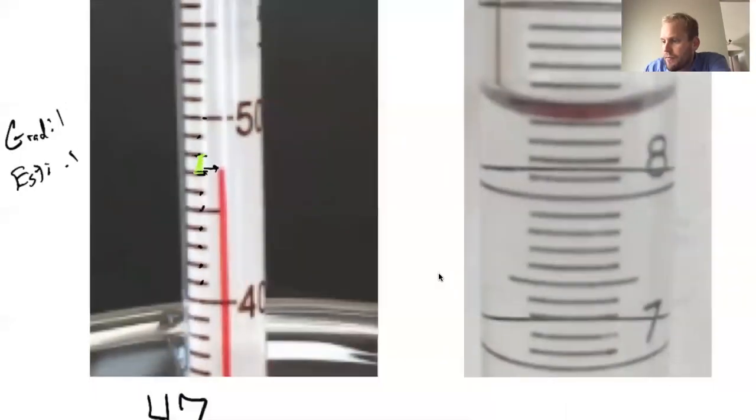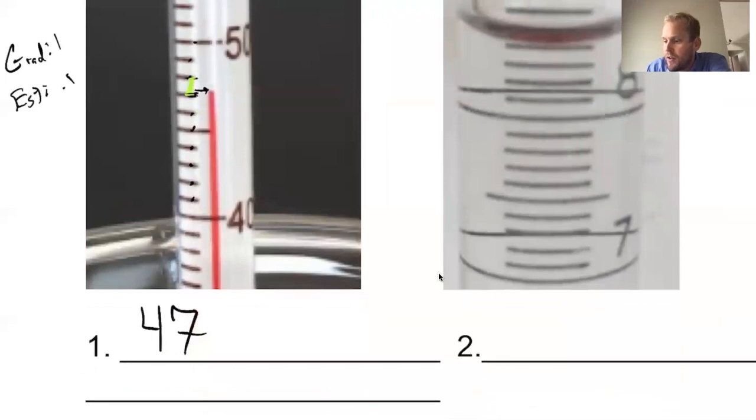Okay, so we visualize 10 marks in here. 2, 3, 4, 5, 6, 7, 8, 9, 10. You make your estimate. Which one is it closest to? It's harder and harder to do, right, as the graduate gets smaller. I might say, I don't know, the third increment. So I might say 47.3. Okay, which is valid because it's an increment of 0.1.